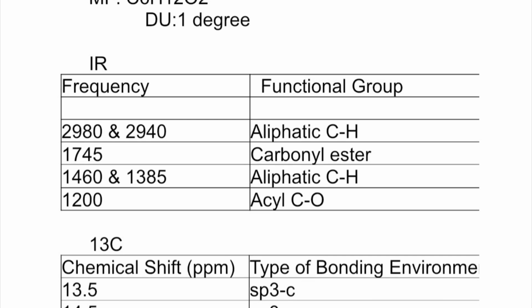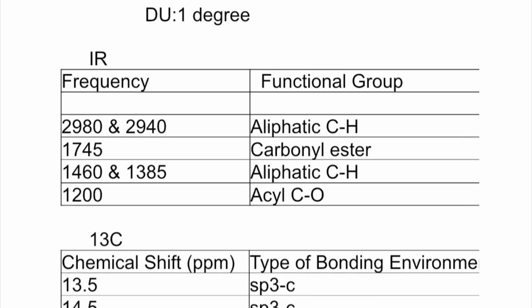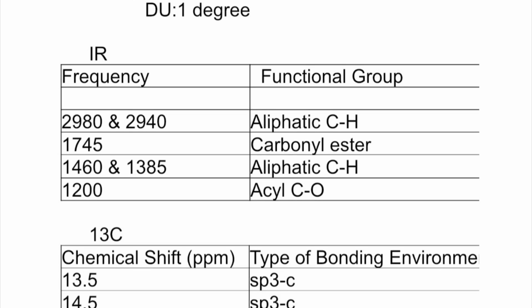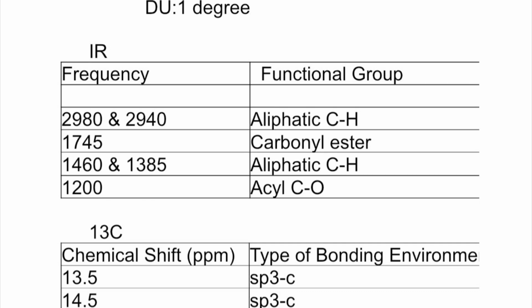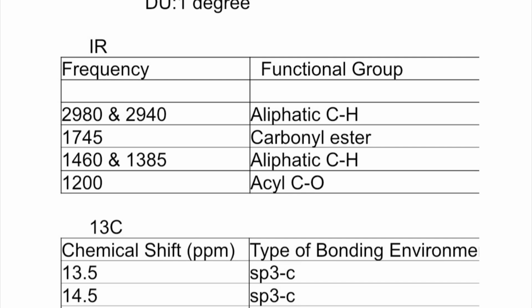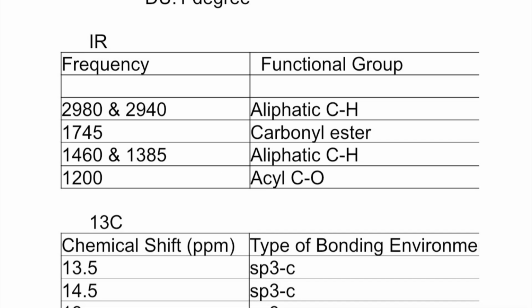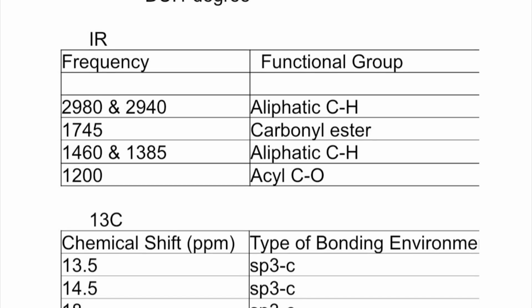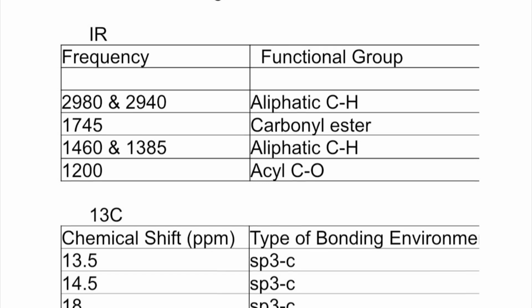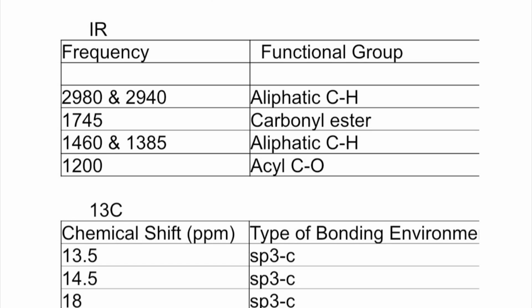The chemical shift at 1.80 is characteristic of a group with an integration of 2 protons and a sextet splitting pattern, indicating that the neighboring group should contain 5 protons. The chemical shift of 2.30 is characteristic of a group with an integration of 2 protons and a triplet splitting pattern, indicating that the neighboring group should contain 2 protons. So pretty much just explaining the number of protons for the 1H.